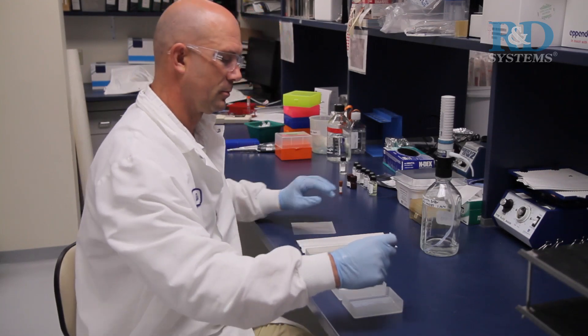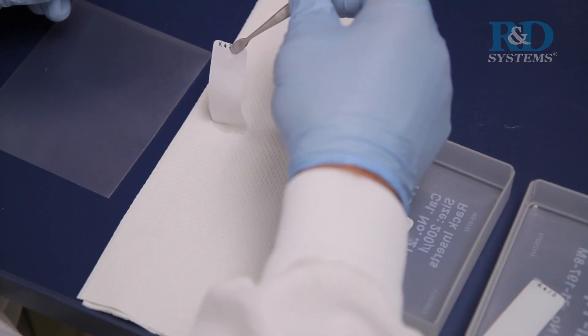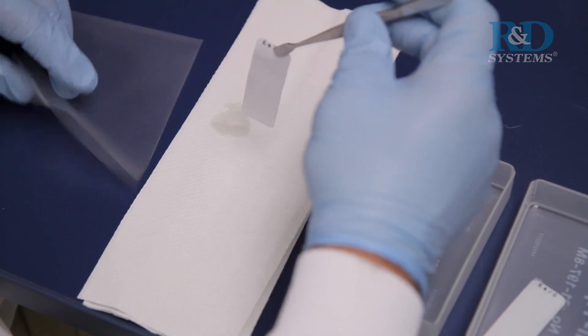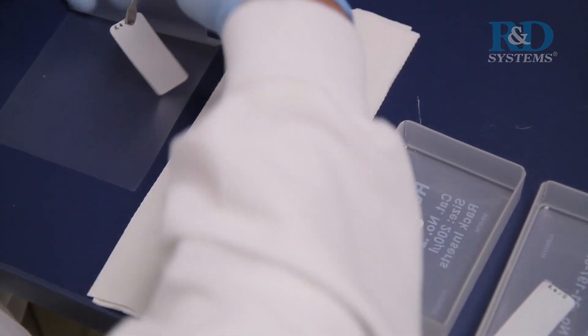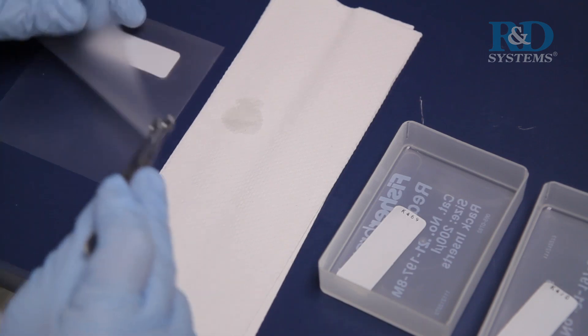Carefully remove each membrane from its wash container. Allow excess buffer to drain from the membrane by blotting the lower edge onto absorbent paper. Place each membrane on a plastic sheet protector with the identification number facing up.